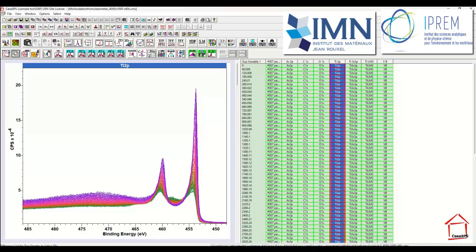The next option, once we've improved the signal to noise in the data, is we'll apply the difference operation, which will allow us to take two spectra and then construct a new VAMAS file that contains spectra that represent different proportions of the two selected spectra. And the different proportions will show us shapes that would not be in the data set but might be interesting in terms of interpreting the data.